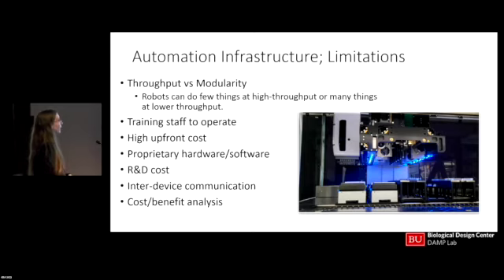R&D costs and just time to develop assays like this aren't cheap. It's not easy. We're a CLIA approved lab, so that process in itself takes a very long time to develop. And then there's cost benefit analysis. We were talking about this in the workshop this morning. Does it make sense to automate something? You have to take into consideration not to automate just to automate it. You have to make sure it's a need.